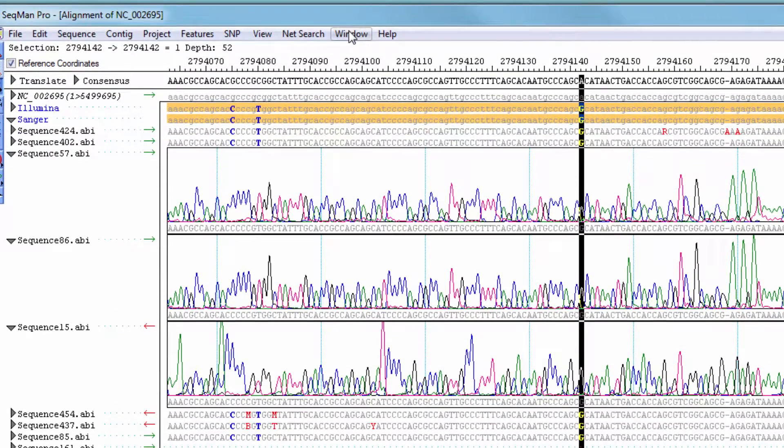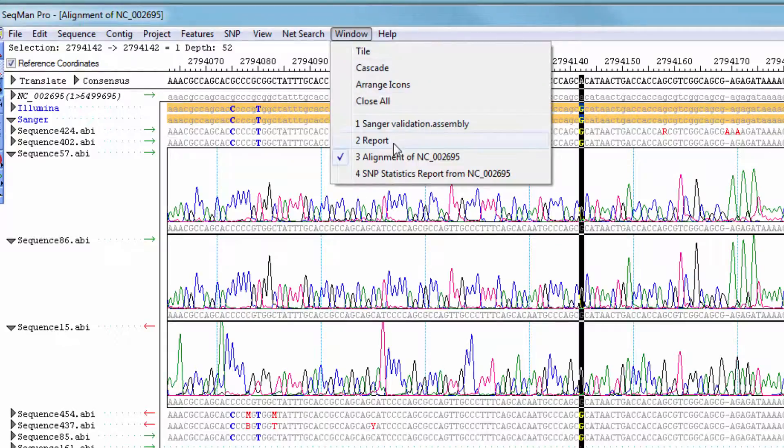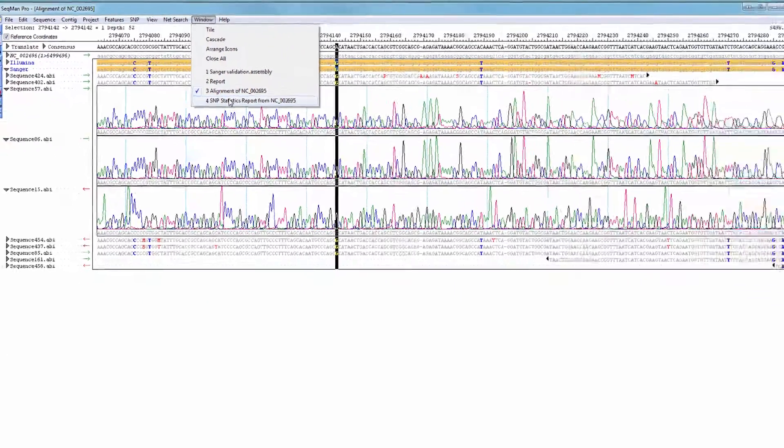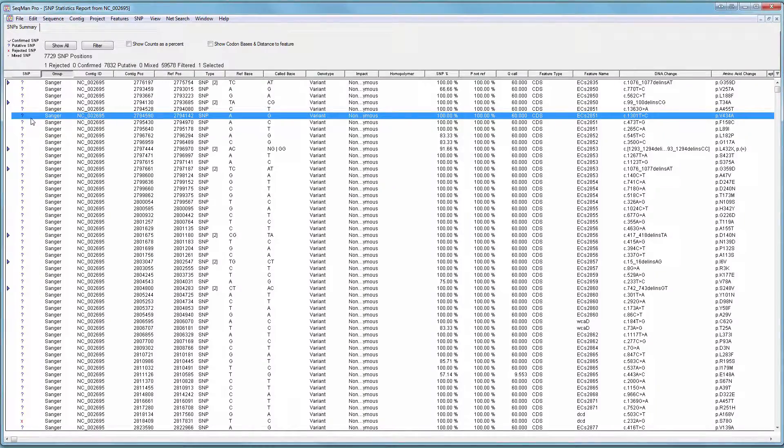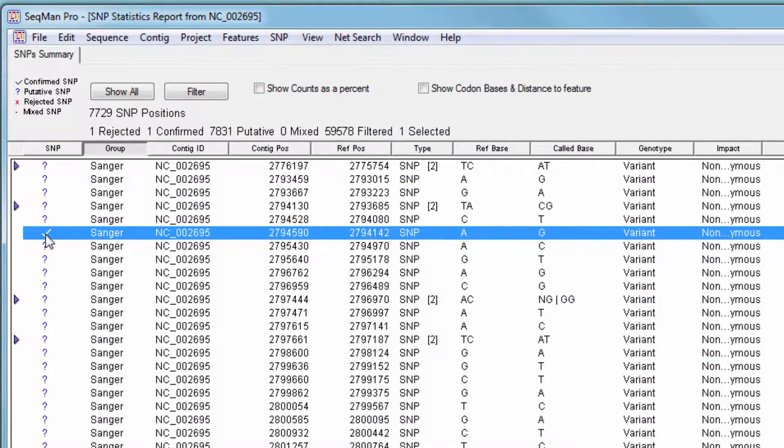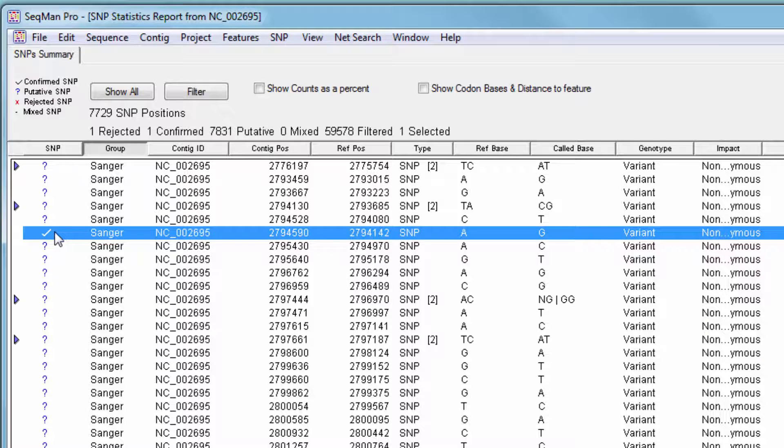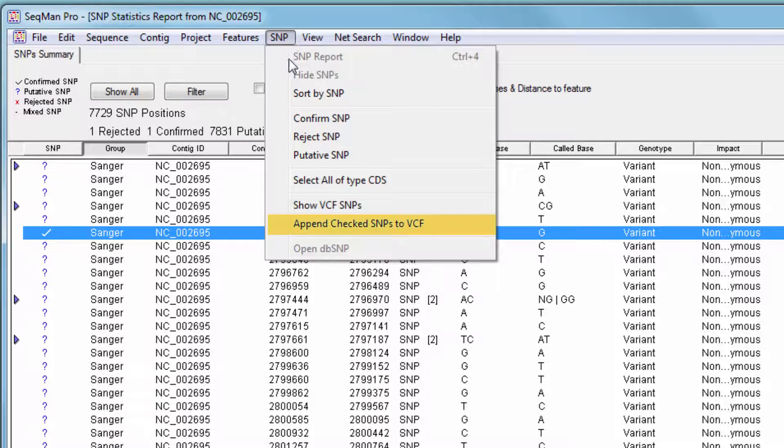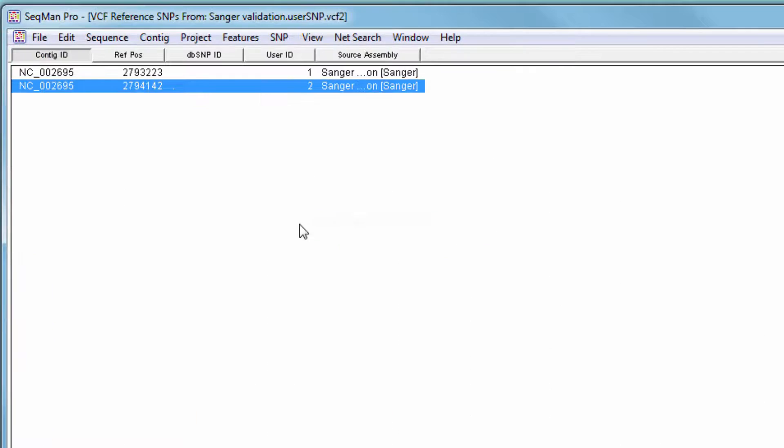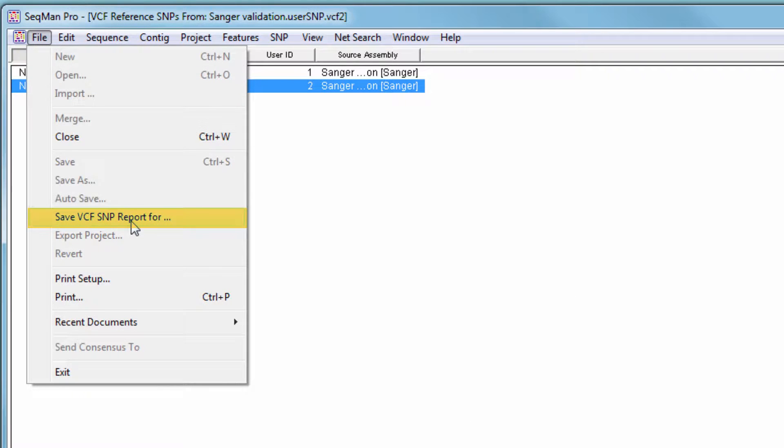If desired, you can confirm SNPs from the SNP report, and then save those SNPs to an existing VCF file, or write a new VCF file for downstream analysis.